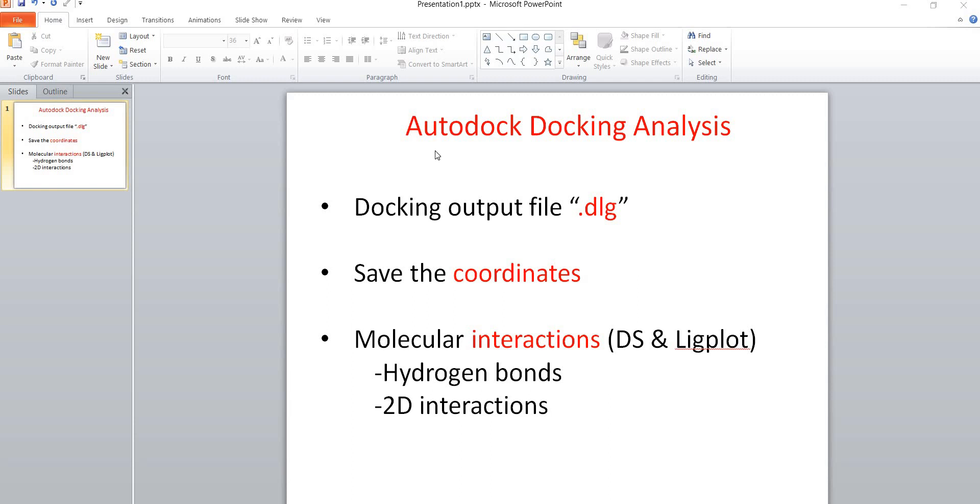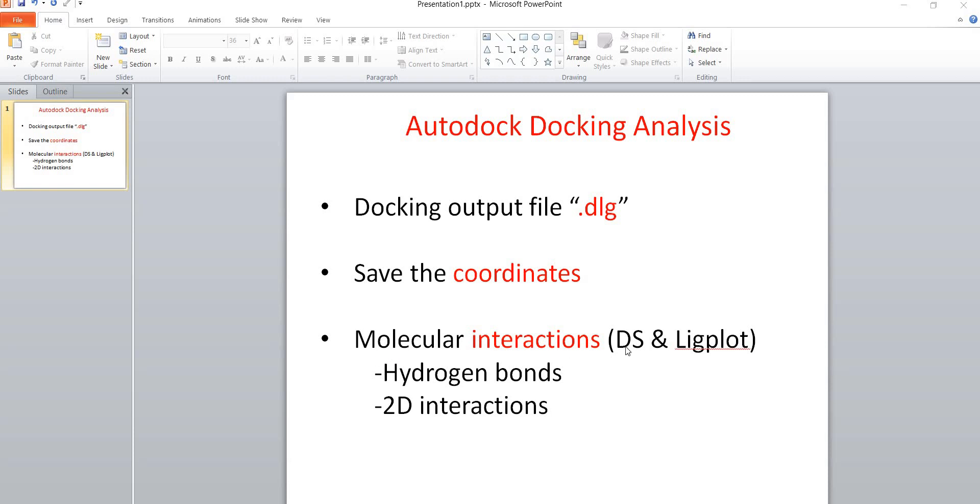Today's demonstration is about Autodock docking analysis. You need a docking output file, check for the .dlg file in your docking folder. We'll save the coordinates for your best pose generated by molecular docking, then analyze molecular interactions using Discovery Studio and LigPlot software where you can analyze hydrogen bond formations and 2D interactions.